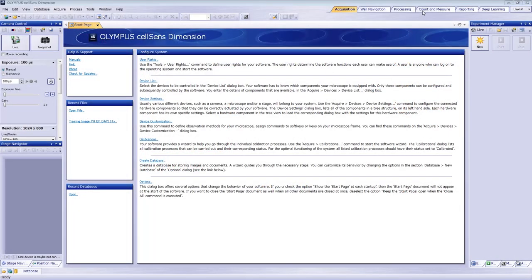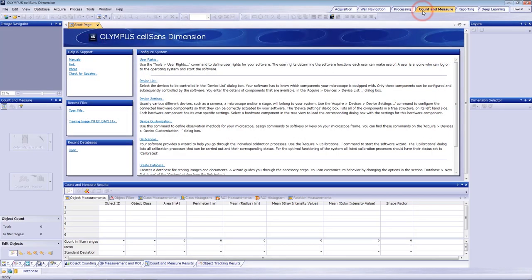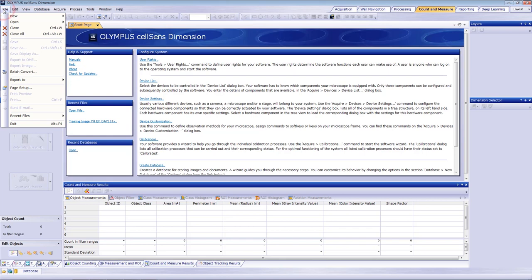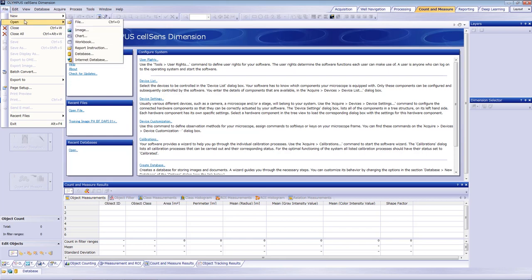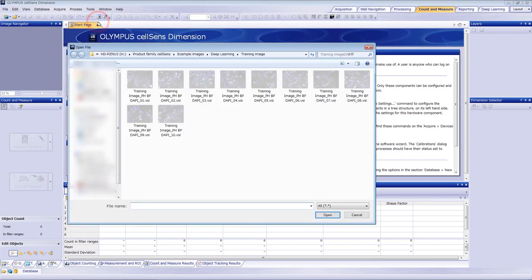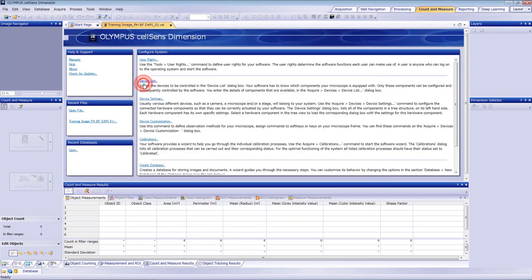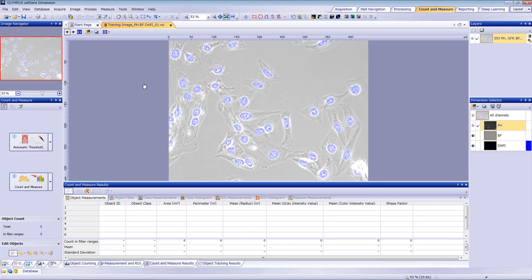To begin, go to CellSense software's Count and Measure tab. Open a training image located in the CellSense installer. To access it, go to CellSense, Example Images, Deep Learning, Training Images. Open the first image.